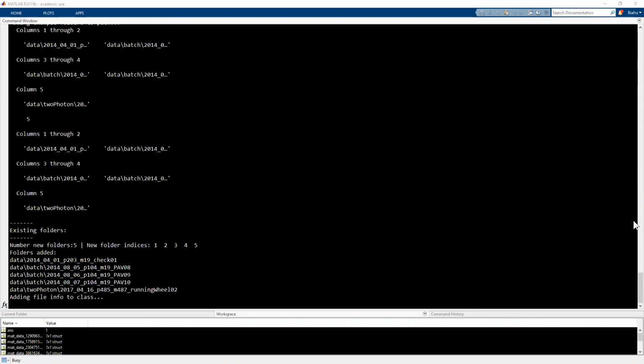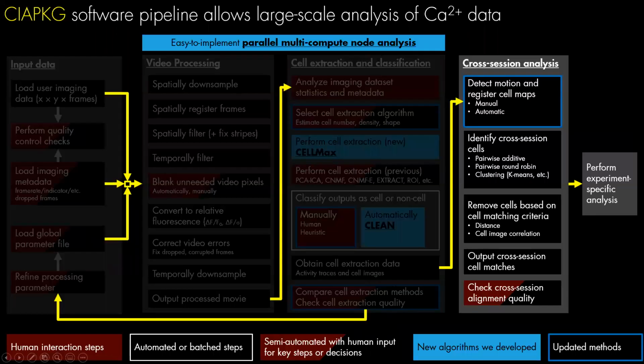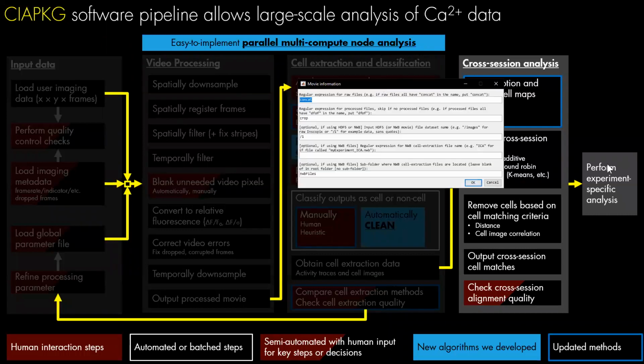And then, sorry about that. My main monitor is on my other screen, so I'm having to deal with that being pulled over.